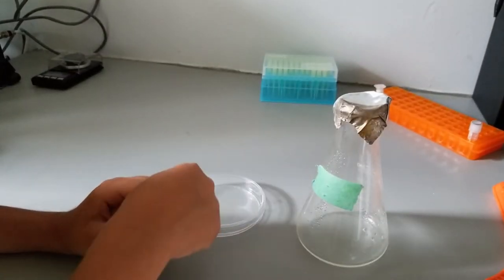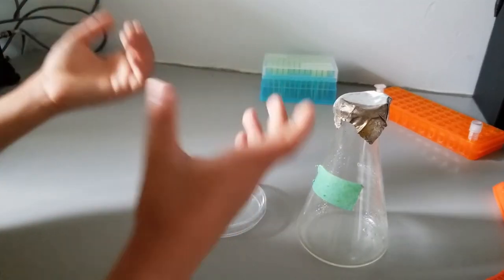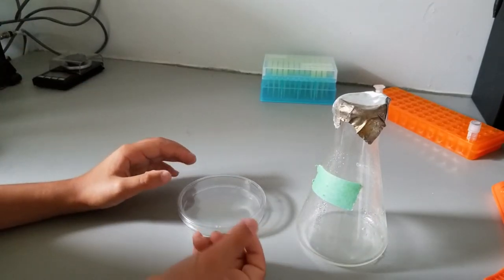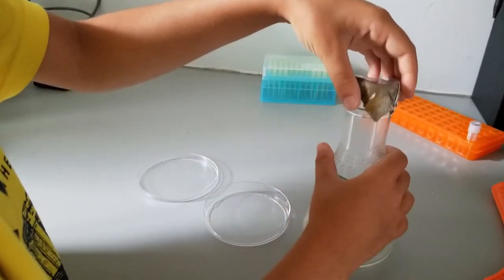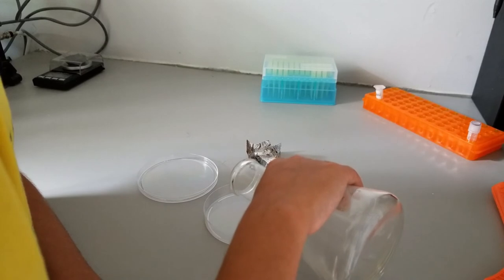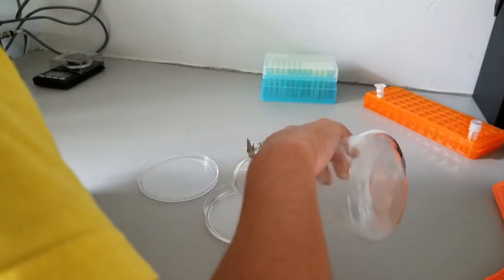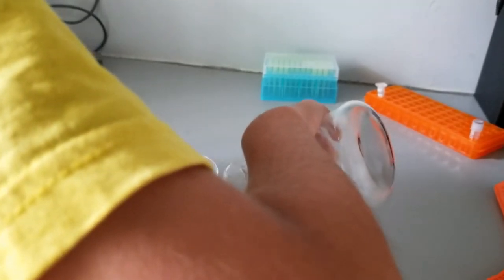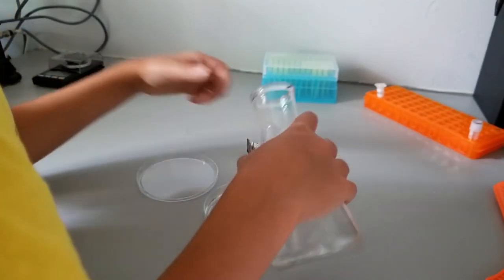Now we pour the mixture into the petri dish. Two things to keep in mind: pour slowly so you don't create bubbles, and don't touch the petri dish too much afterward so it stays level. We open the petri dish and slowly pour the mixture in. Once you're done, tip it to get all the drips, then flip the lid upside down — and that's it.